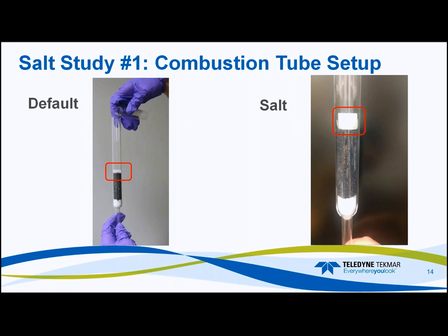We wanted to look at these two different setups because previous experience with these quartz beads is that once you get salt onto them, it doesn't take very long before you end up getting a cement block, and we will see that coming up.